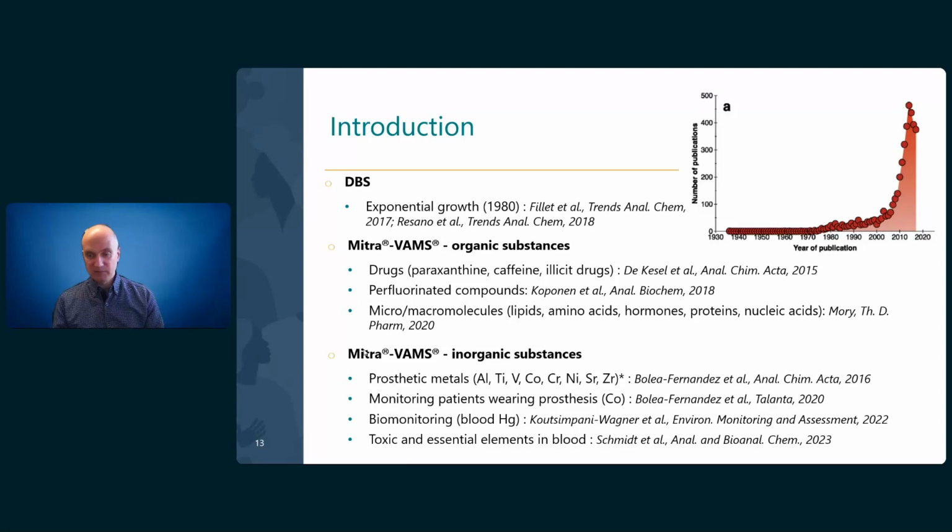Then a second paper by the same group was used for cobalt measurement in patients with prostheses. So this method has been applied to real patients.